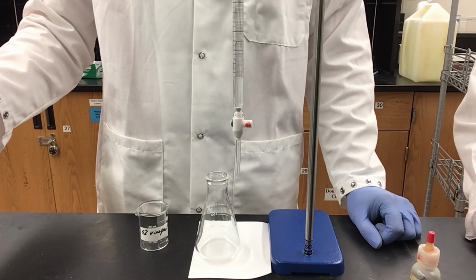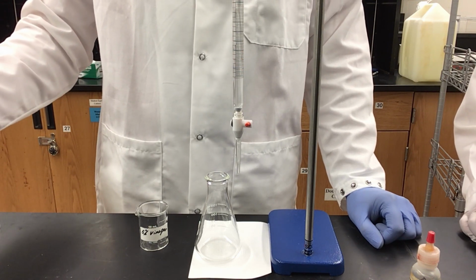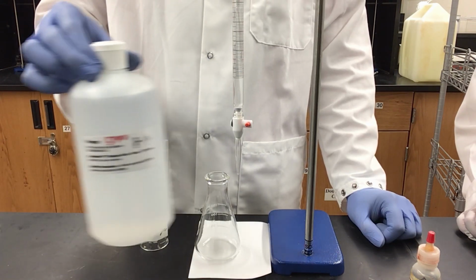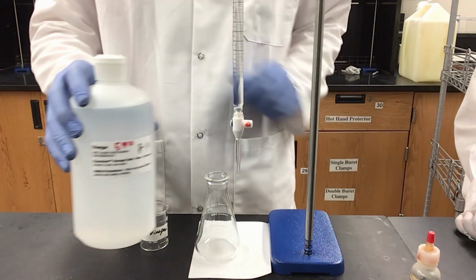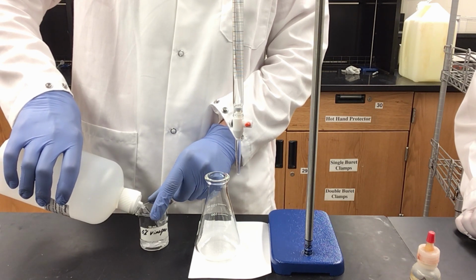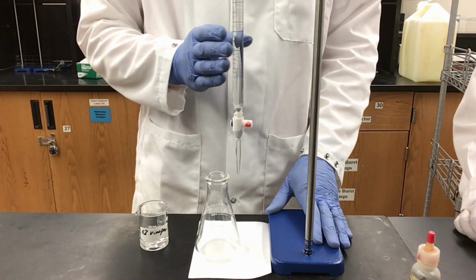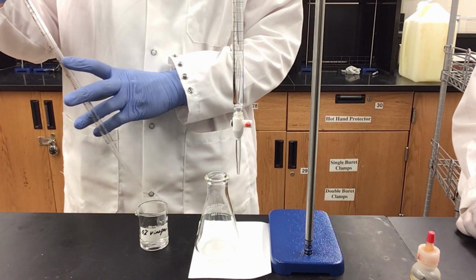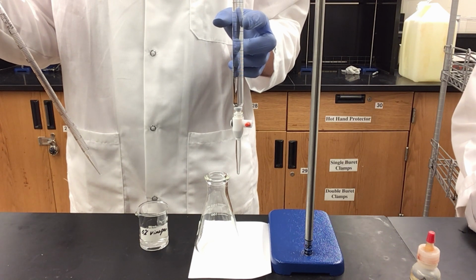In this next part, we are investigating the acid content of consumer products. To start, we are going to be using vinegar or acetic acid. We have a solution of 5% vinegar right here. This is the approximate concentration. We do not know for sure, which is why we are going to be titrating it with our now standardized 0.1 molar sodium hydroxide.